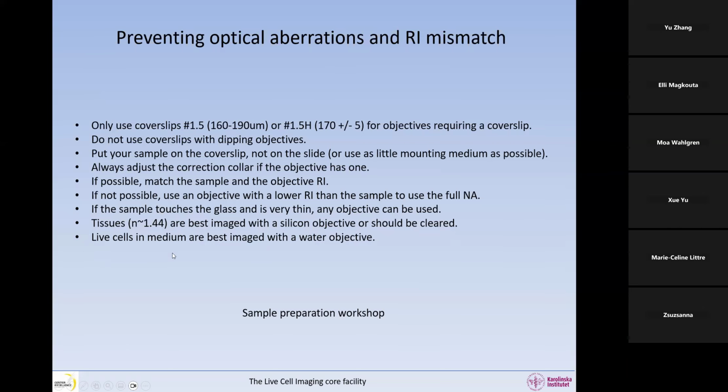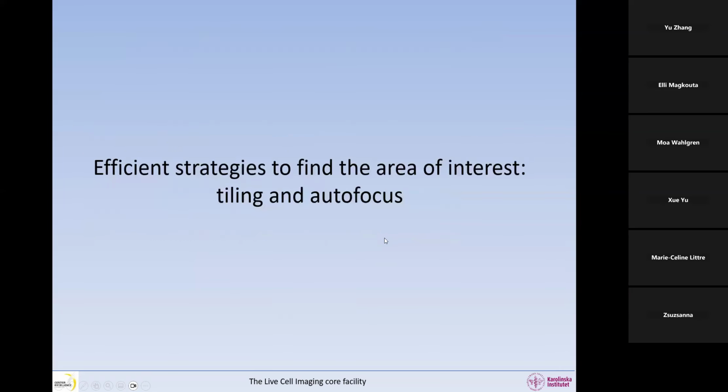And if you have live cells in medium, always use a water objective or an air objective, but you will get the best resolution with a water objective. They have higher NAs. So this is what I wanted to say for now.